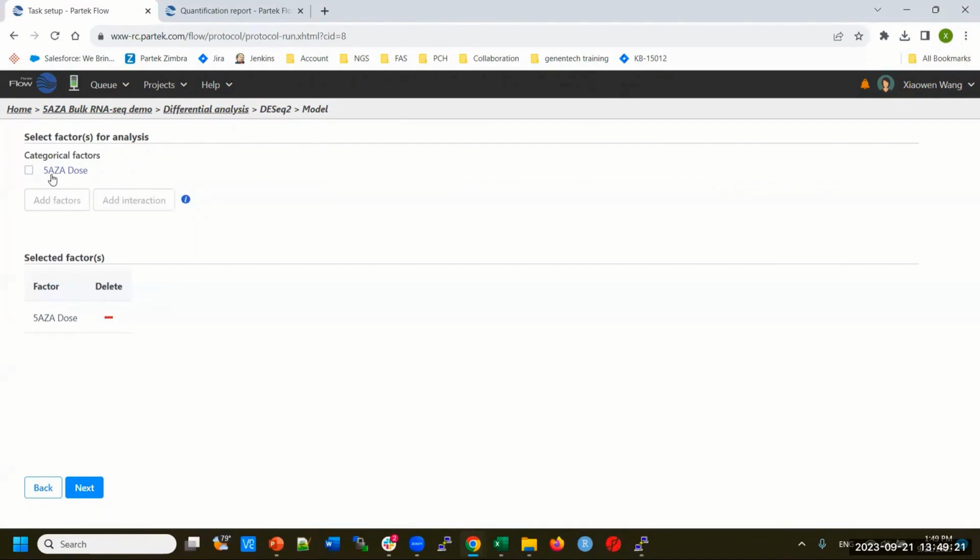The blue color means categorical information. If you have numeric information, suppose I have age, I coded as numeric, they're going to be in green color. So you choose, that's how you build a model, so only one factor analysis.